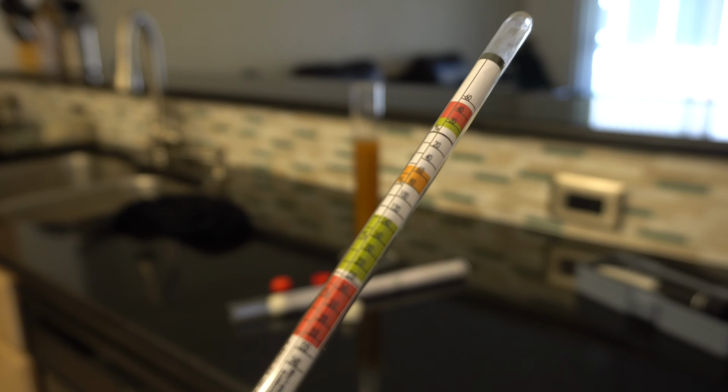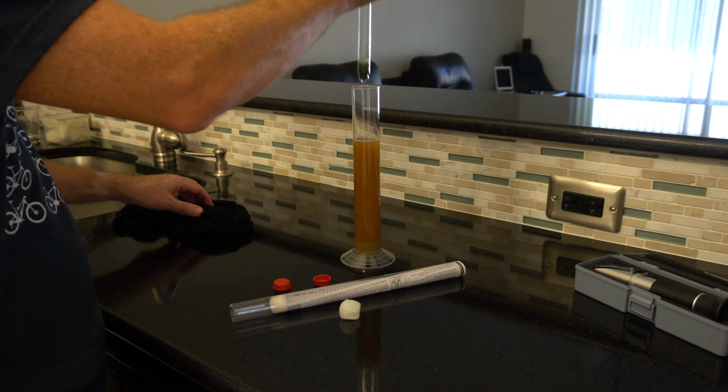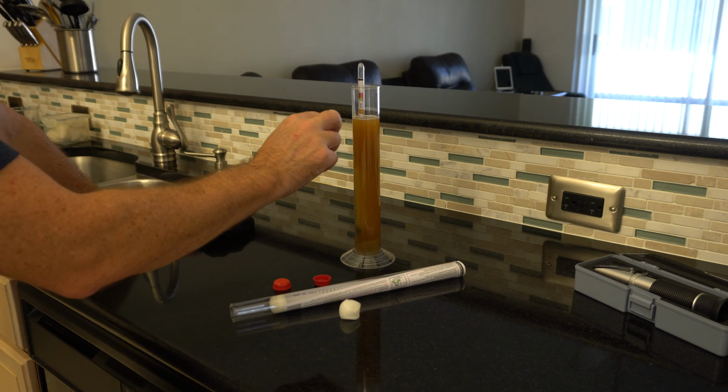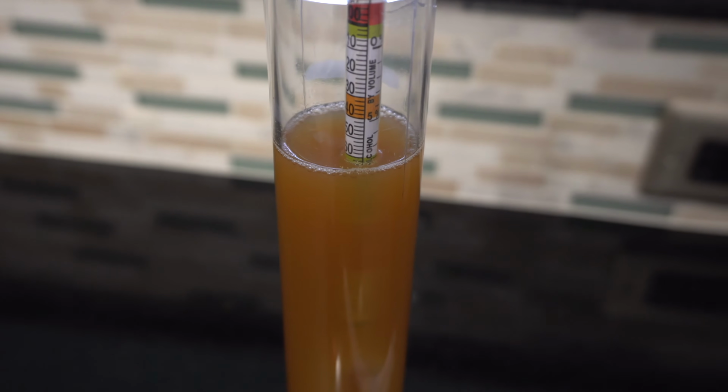So how do we go about doing this? There are two common tools available to the home brewer. One is a hydrometer. It costs around $10 US or €9. It uses a weighted bob with a scale printed on the side. To use it, just sanitize the vessel and fill it with enough liquid to make the bob float, then read the specific gravity directly off the scale.